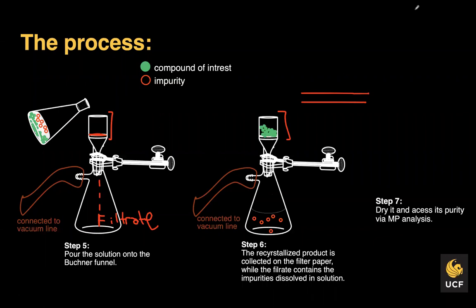So let's see. We're taking the flask off the heat source and placing it on the bench top to cool. Does that shock the crystals? Yes, in a way. If you had it on the hot plate, and the hot plate was warming it up, and all of a sudden you put it on the bench top, the difference in temperatures is quite a bit. But in this case, it doesn't. But you could always keep it on the hot plate to cool down as well, right? Good point, Nicholas.